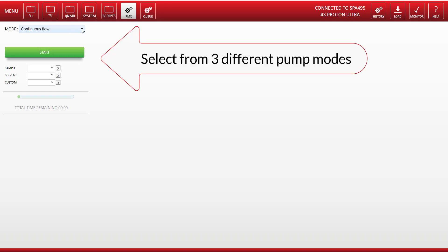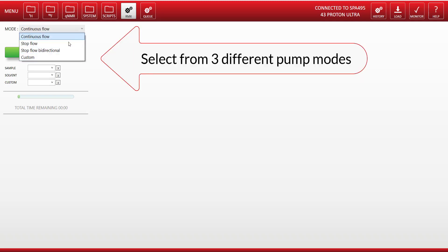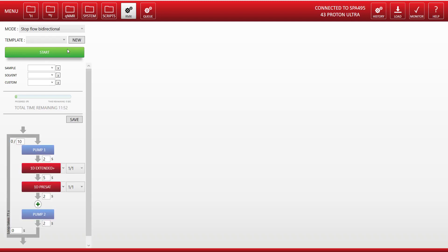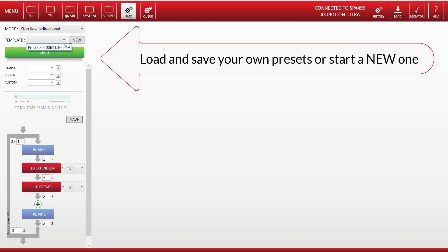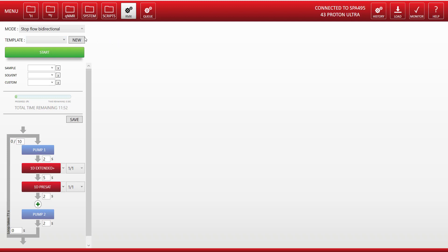You can find the software module in the main menu under the RMX button. You can select from three different modes for controlling the pump: continuous, stop flow, or bi-directional stop flow. And then you can select from pre-recorded templates or create your own template from scratch.